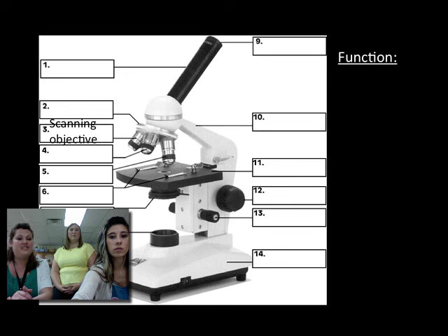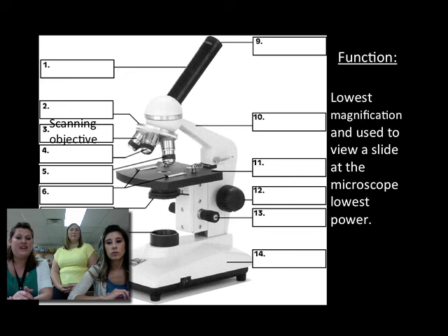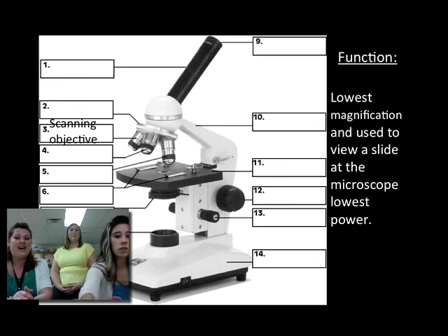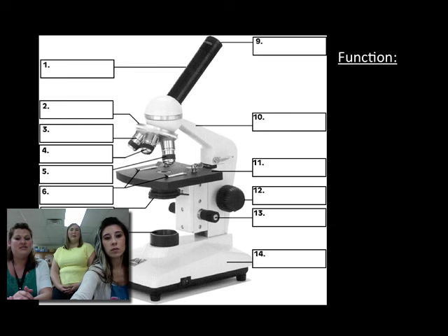Next we have the scanning objective. It's the lowest magnification and used to view a slide at the microscope's lowest power. This is the objective you should always start with.